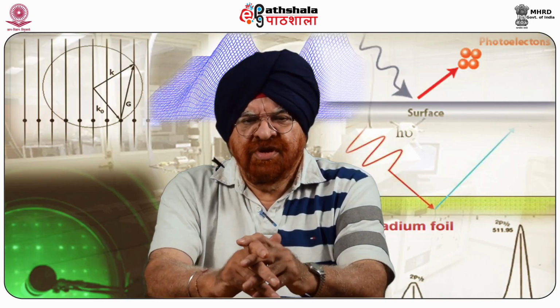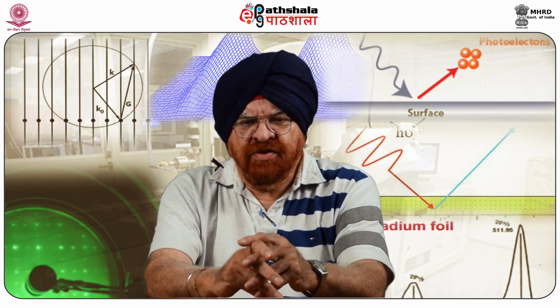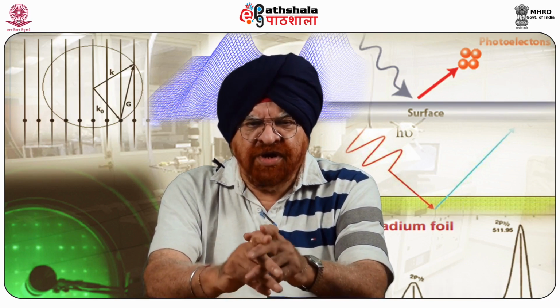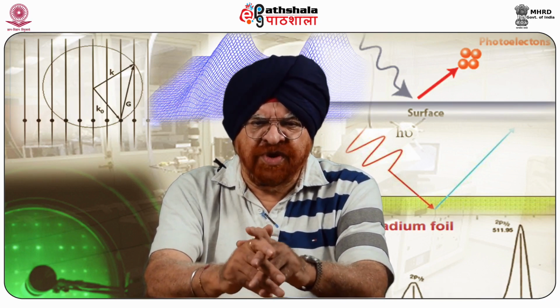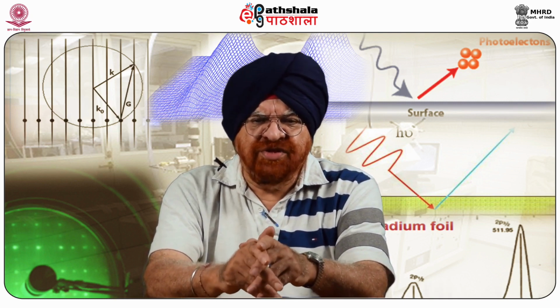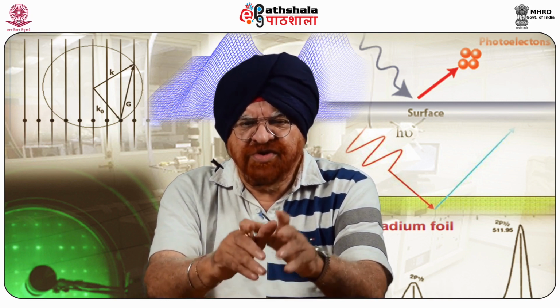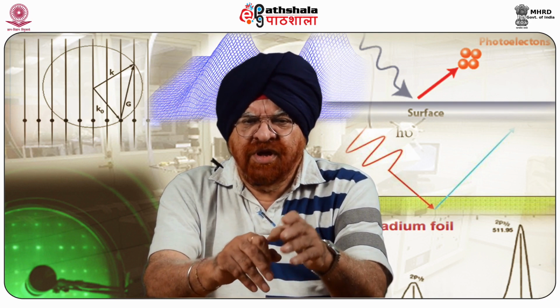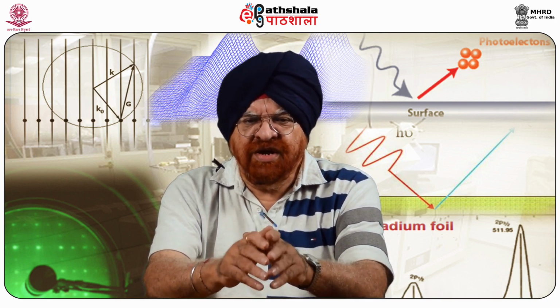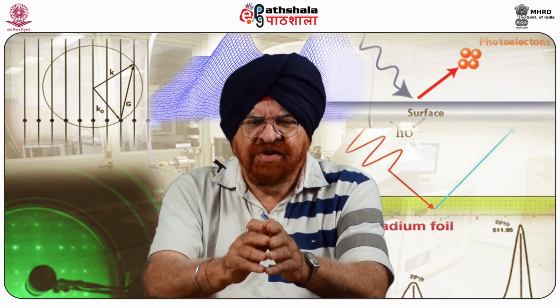So, students, having given you the complete introduction of this particular important technique called Kelvin probe force microscopy, which, as I said in the beginning, is very similar to atomic force microscopy, written as AFM, it is a very useful, powerful technique for probing electrical and transport phenomena at the solid-gas interface.